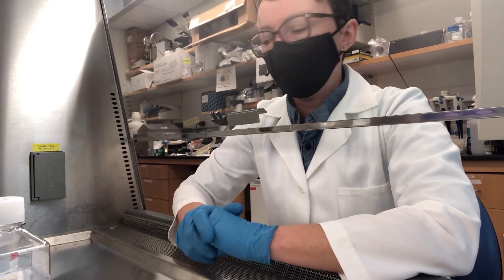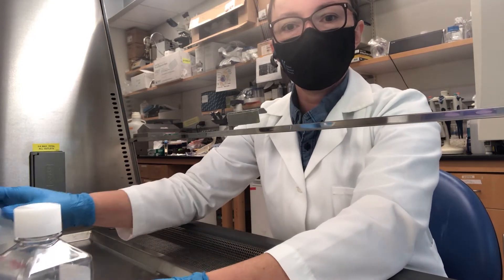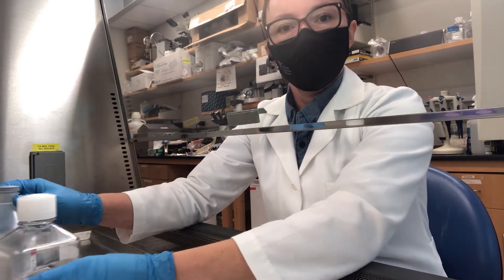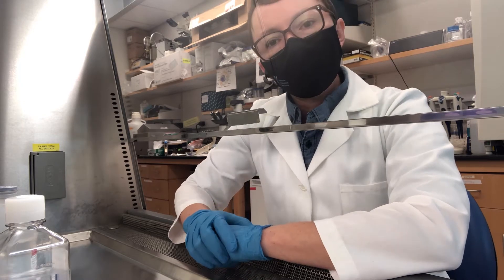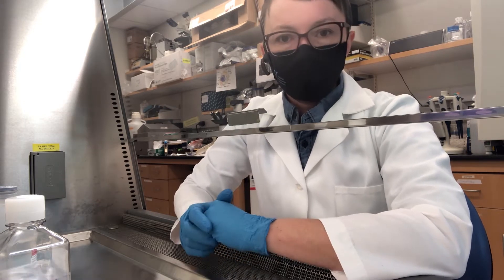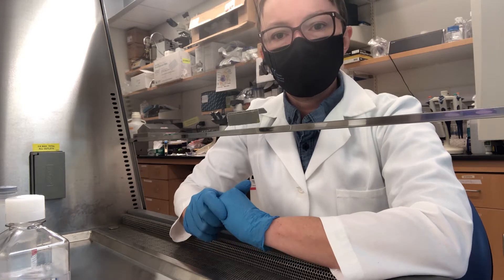Before we start, we want to make sure that our DPBS and our lymphoprep, as well as our blood sample and our centrifuge, are all at room temperature. I've divided the protocol into four parts to make it a little bit easier, so let's get started with part one.